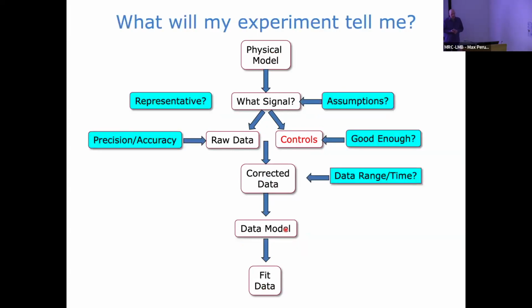So what are the assumptions in that? Is your signal representative? How precise and accurate is your raw data? Are your controls good enough? Have you got the right data and time?